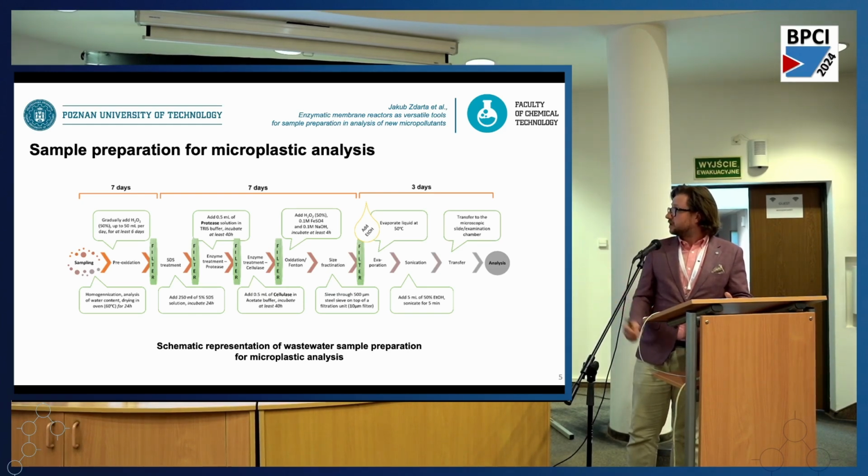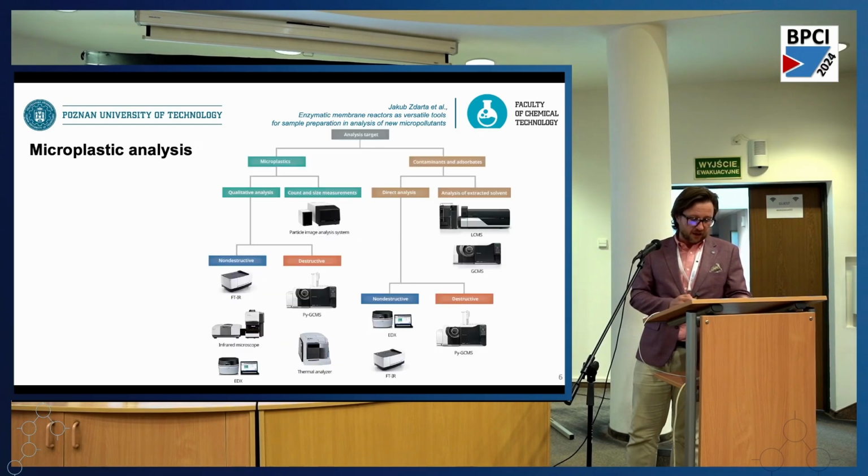Such a complicated sample preparation is not cost effective. This is very important. And what is more, the use of so many filtration steps might lead to the loss of some plastic analytes, some plastic fibers, some synthetic polymers.